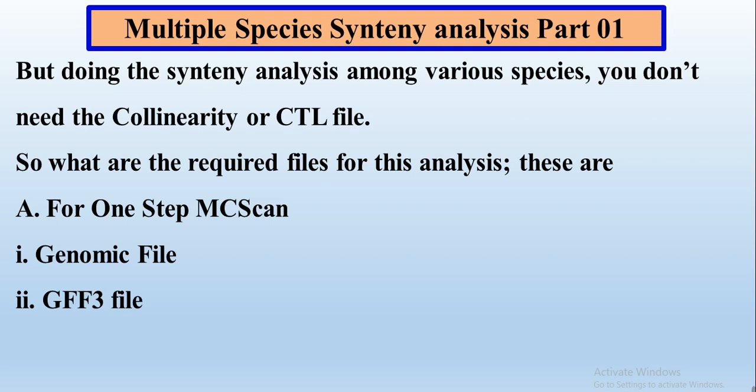For example, we need the genomic file and GFF file of all the organisms. For example, we want to know the synteny analysis of our protein family — the HSP70 gene family that I am working on in Solanum lycopersicum — and I want to check its syntenic region in other three or four crops like Oryza sativa, Glycine max, or Arabidopsis thaliana. So we need the genomic and GFF3 file of all these organisms.